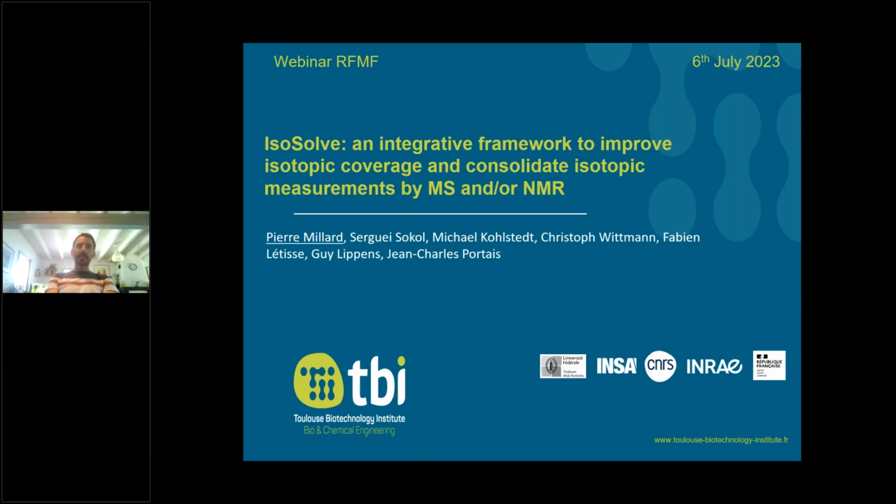So today, Pierre will present IsoSolve, an integrative framework to improve isotopic coverage and consolidate isotopic measurements by MS and NMR. So Pierre, the floor is yours.